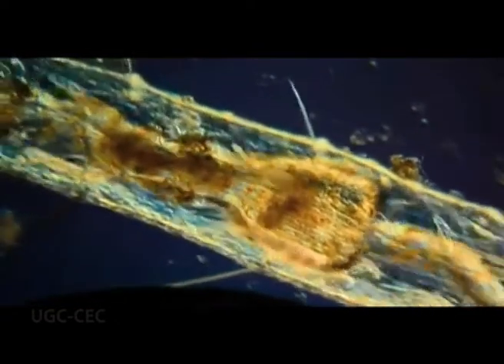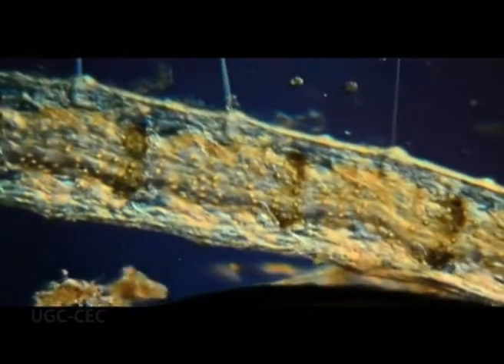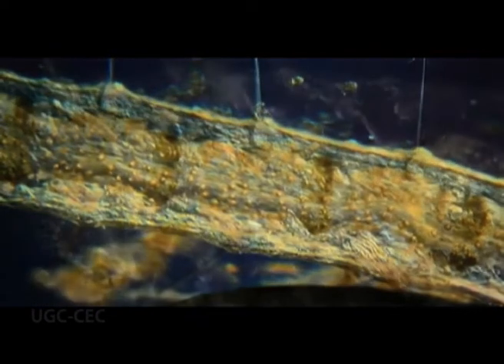Let's see a small video of our friends. Are they aliens? No. My dear friends, these tiny organisms are very much part of our planet, but because they are so small in size, we could never learn about them. It is the invention of these microscopes because of which we are able to look at these tiny creatures. Let's learn about these techniques and the instruments which opened the windows for us to look into the tiny little world of these microorganisms. But first, let's define microscopy.